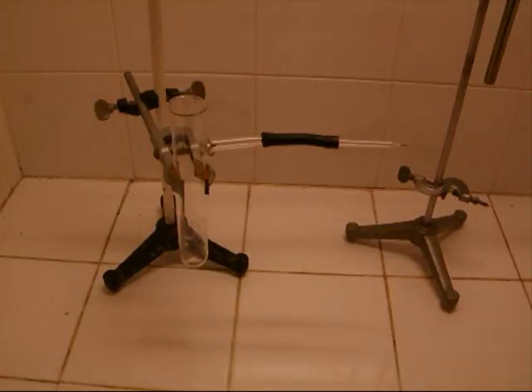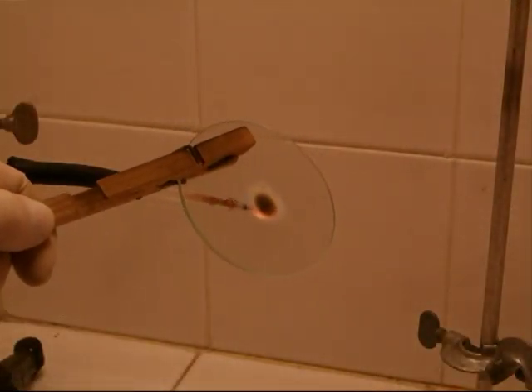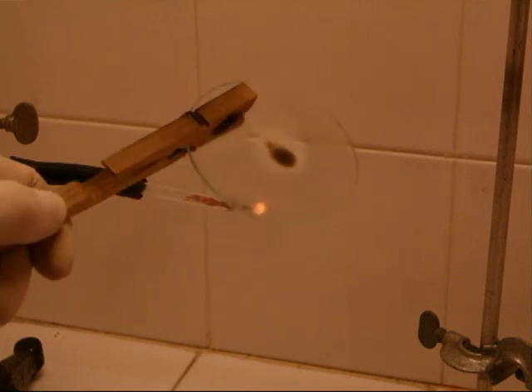Hello and welcome to my first self-spoken chemistry video on YouTube. The Marsh test is an old method to detect arsenic. Also, you can detect antimony and germanium with this test.